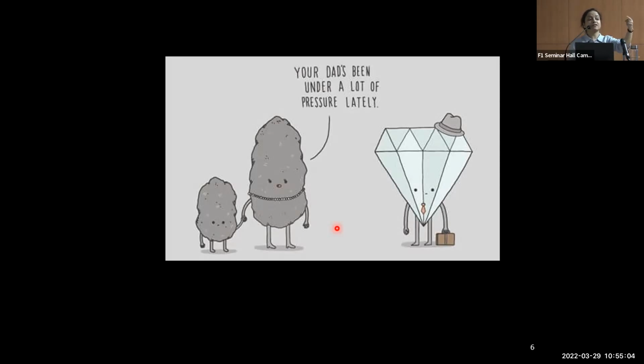You're correct, but why does it increase? The angle at which the lens is cut. Any glass, or diamond, the angle at which it is cut increases the value of the diamond. Similarly, the lens, in order to shine with a particular angular aperture, needs to be cut at a certain angle. And therefore, the price of the lens is enormous. All right. So whenever you're working in the lab, be very careful with the lens. They can go up easily from 80,000 and above for a simple microscope as well.